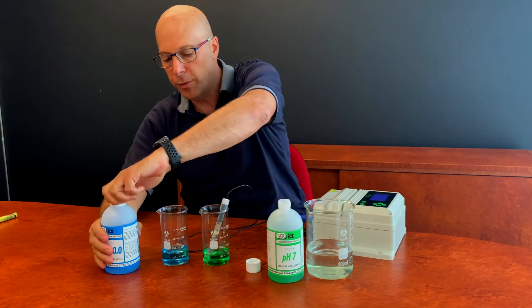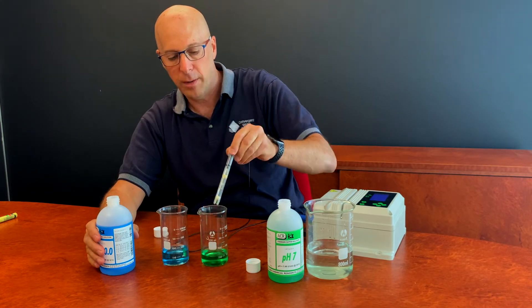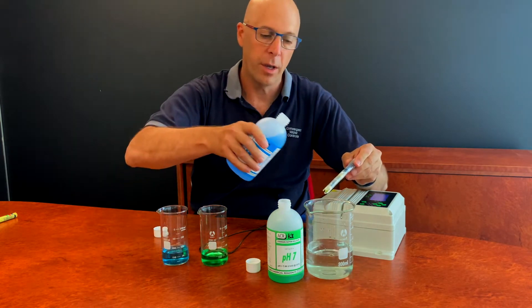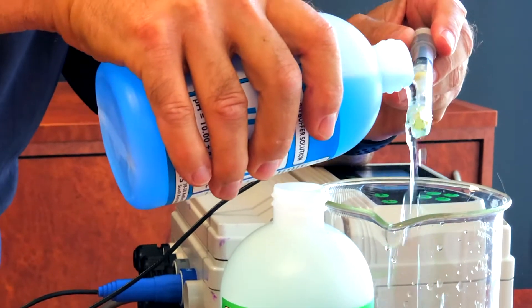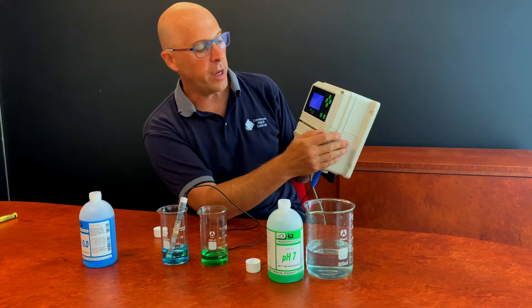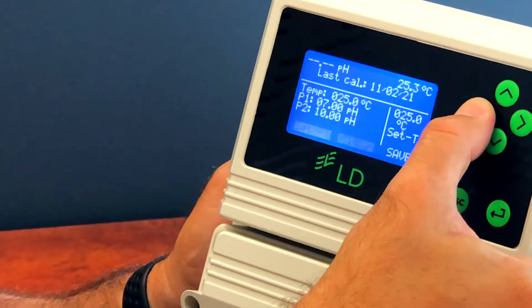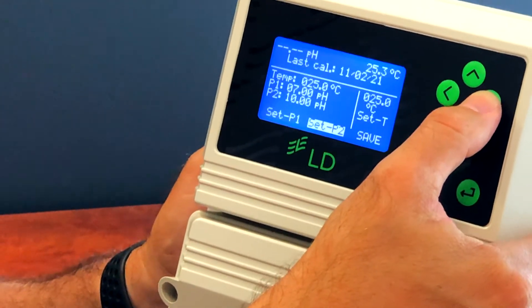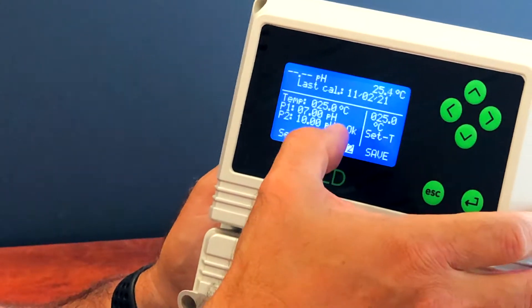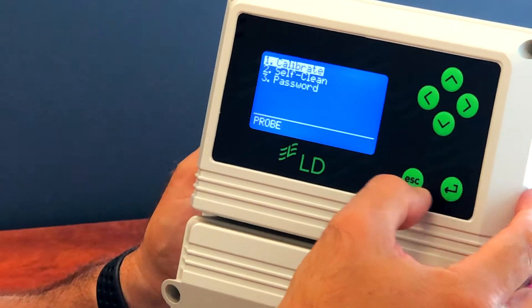Remove the probe from buffer 7, ideally rinse it in a bit of water, give it a shake or a dry. Rinse the probe with buffer 10 and then insert it in the 10 solution. Go back into the calibration menu, move the cursor to set P2 which is 10, and press enter. It says OK. Move the cursor to save, save the value, press enter, then escape.